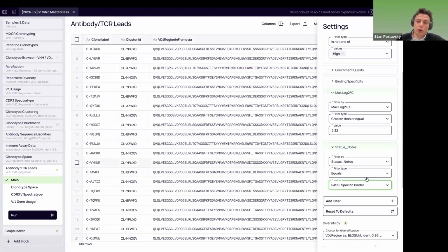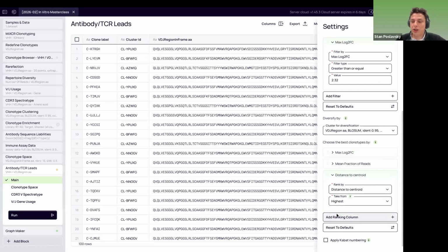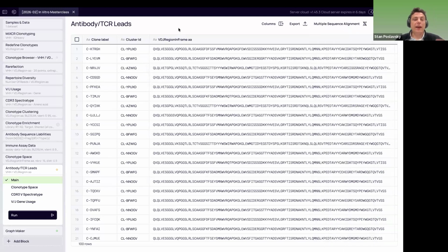Yeah. So it will be better to use it actually as a ranking. We first will pick the candidates that belong to the families that we validated with a functional assay, and then the rest of them.